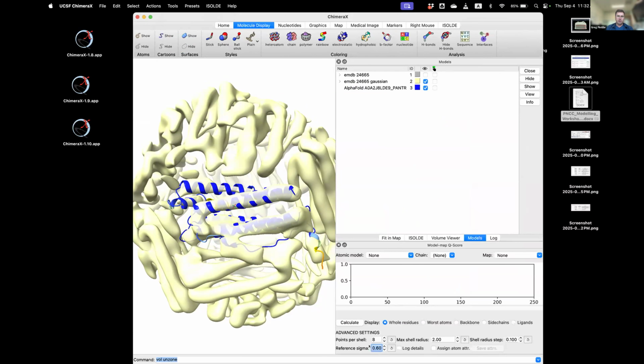But the one we've used and done all of these statistical models on initially was 0.6, but now all the statistical models are based on 0.4. So if you want to match what EMDB is doing, you just have to use 0.4. When you're looking at your own map and model, it doesn't matter what value you use because you're not interested in comparing across maps and models. It's only important to use the same value when you're comparing different maps and models.